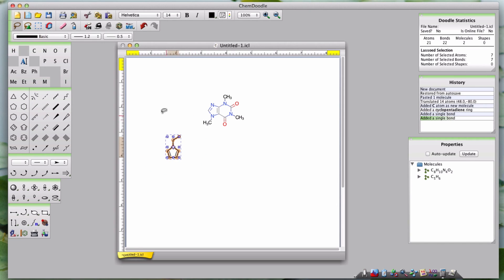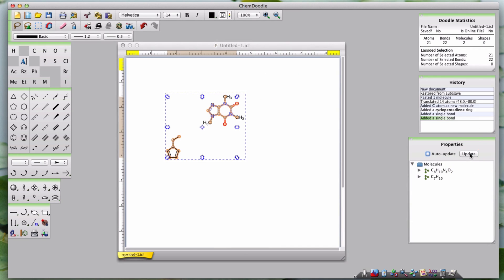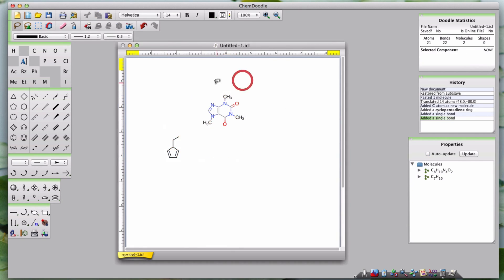If the checkbox is deselected, then you can click the Update button to the right of the checkbox at any time to update the information in each selected molecule based on any changes you have made.